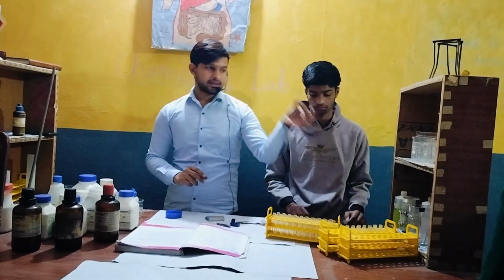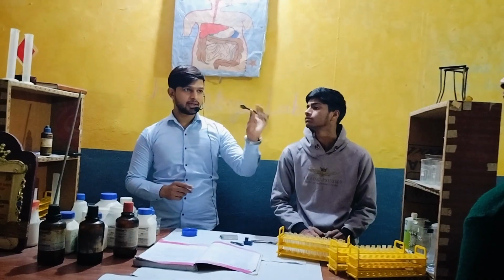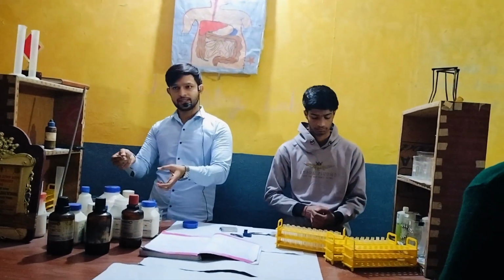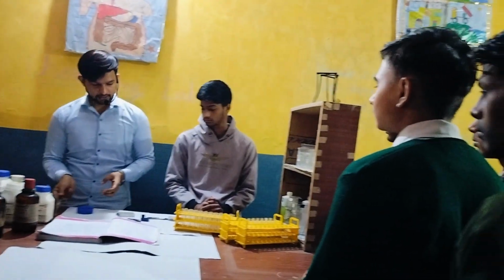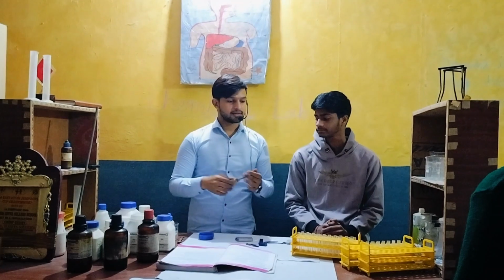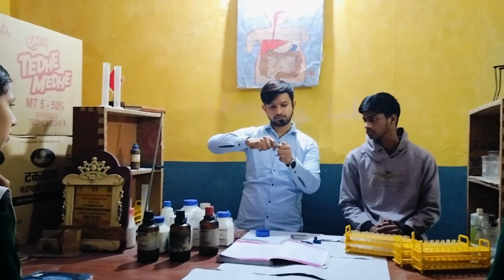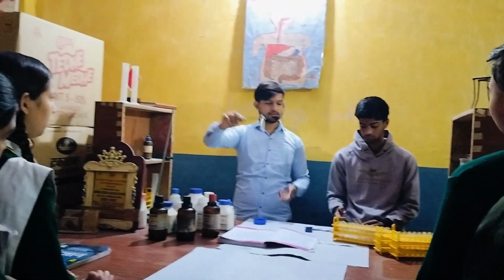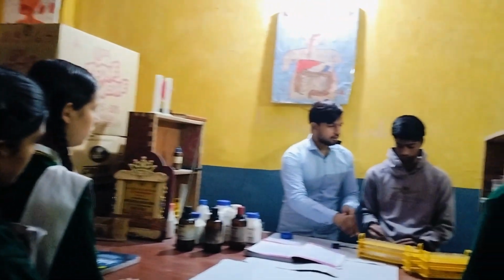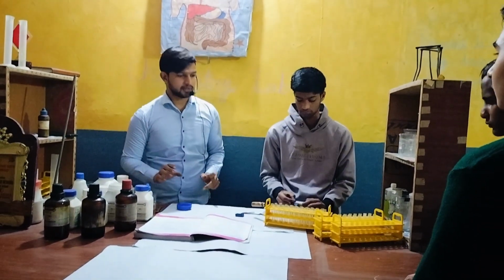Next, what is this? It is a spatula, spoon shaped. We take the salt from the container and perform the experiment with the help of the spatula. And this is the test tube holder. We will place the test tube like this to perform the experiment. So that's it. Now we will start doing our experiment.